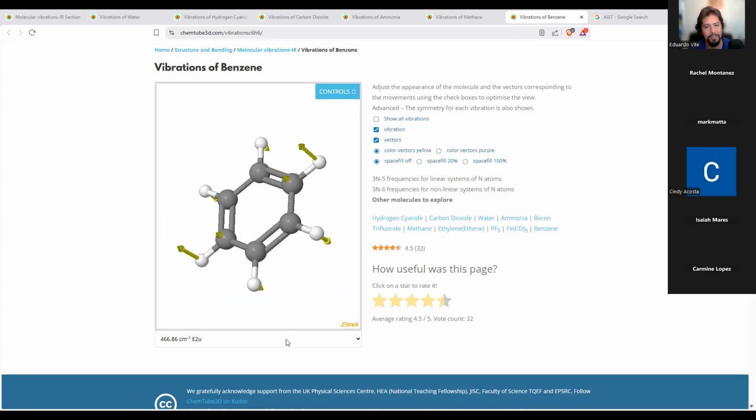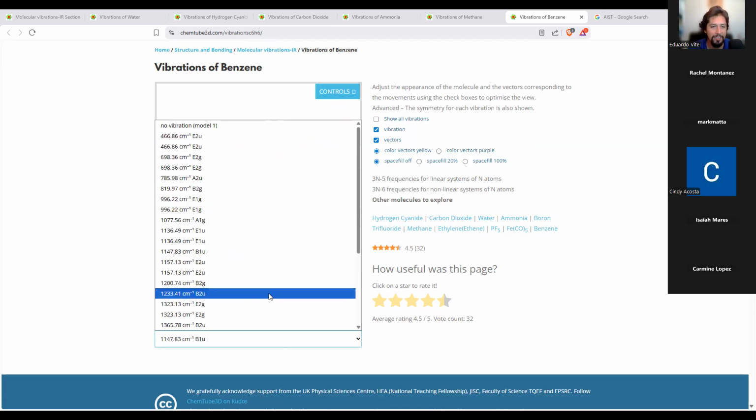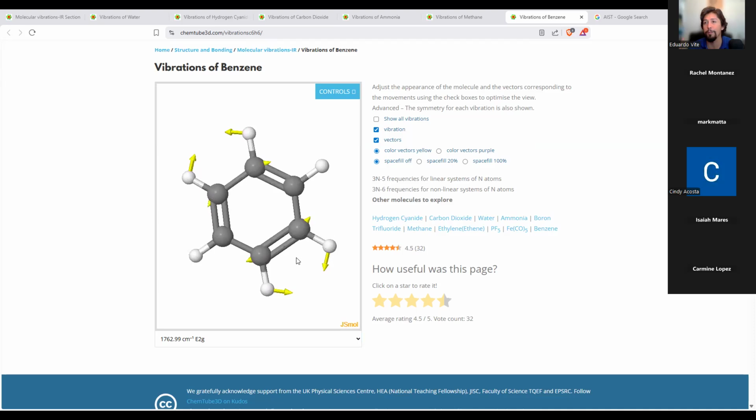And this one is happening more asymmetrically. Yeah, see now it's just starting to wiggle around in interesting ways. Yeah, so again, the more complex the molecule, the more unique vibrations and the more signals it'll show. And again, that gives us a fingerprint. So this is what we are putting on that graph. Those squiggly lines that I'm showing you, this is what they represent.